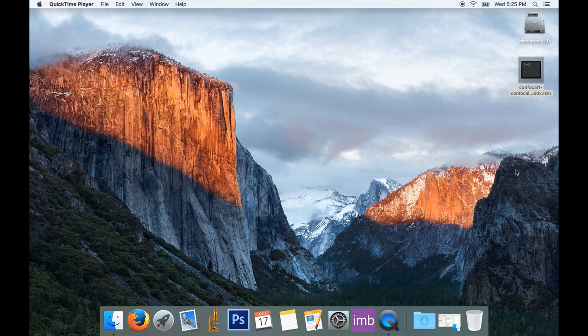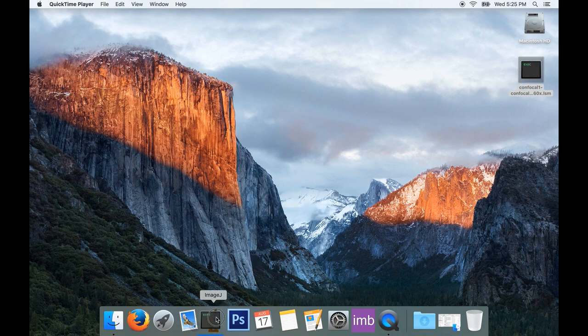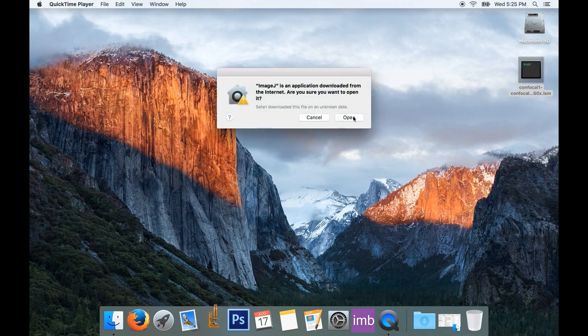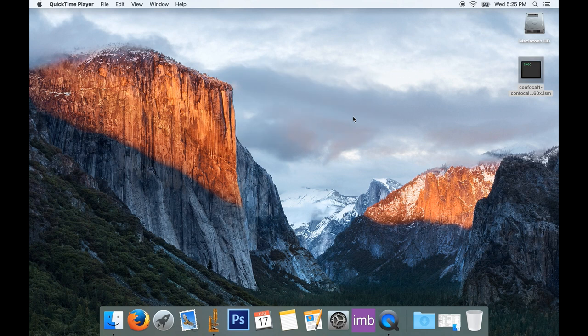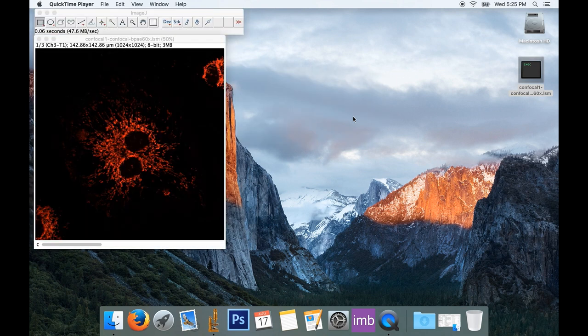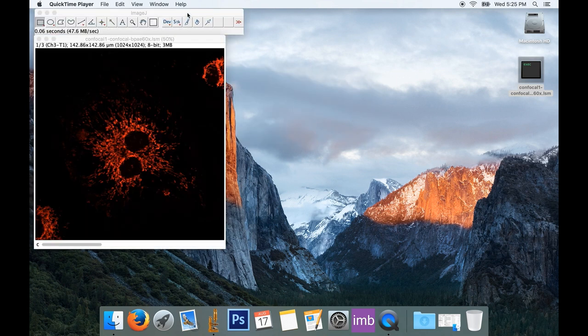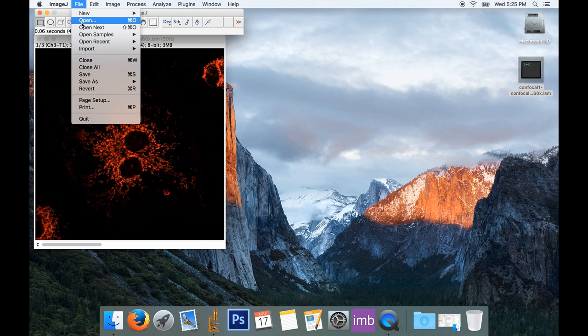To open my file, I'll just drag it onto my ImageJ icon in my dock, but I could just as well have started up ImageJ and selected File Open from the menu to open my image.